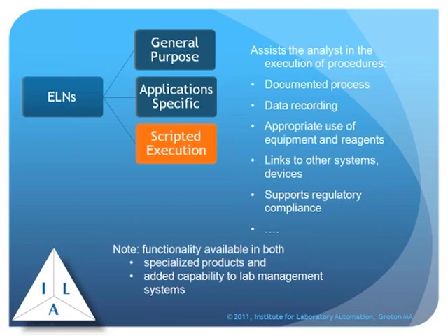So scripted execution systems really document the process of doing a test, record all the data, make sure that all the reagents and equipment are appropriate for the purpose they're being used for, provide links to other systems and devices, and are really geared to supporting regulatory compliance.